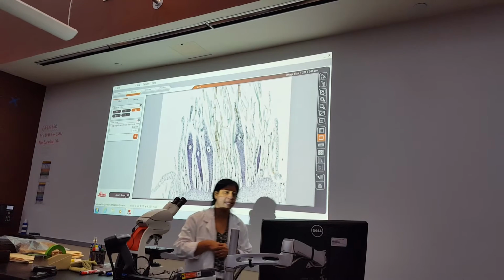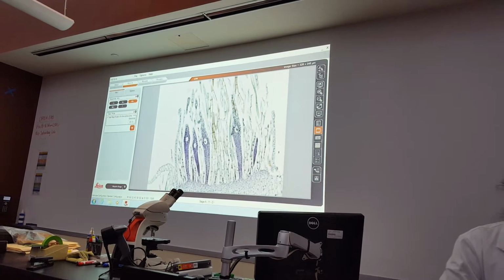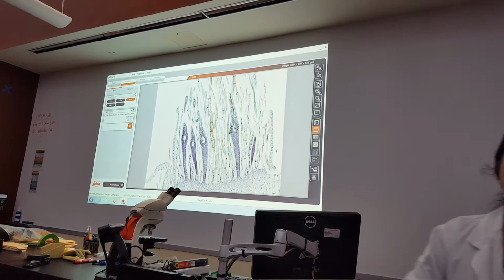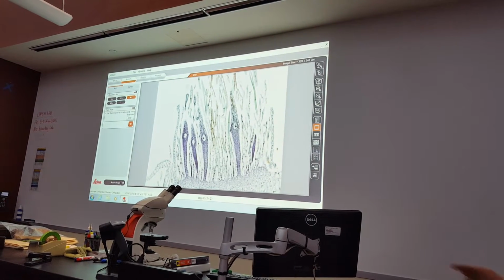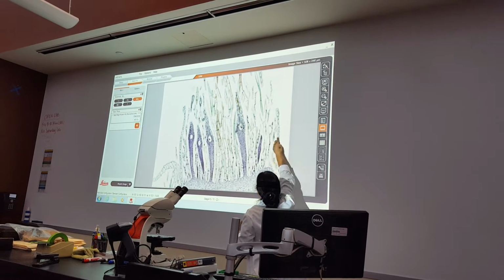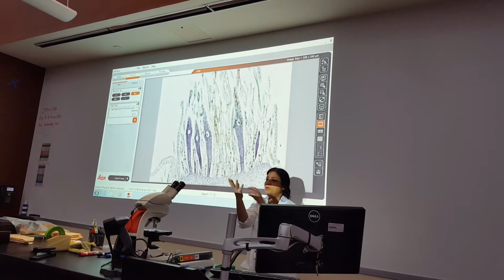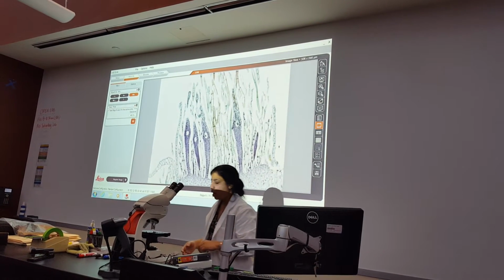Female. So if it is female, is it Antheridia or Archegonia? Archegonia always bear the egg. This is moss, moss Archegonia. Between, look at this, those are the leaves. It's like a flower. The leaves are surrounding the Archegonia, which are sitting in the center.